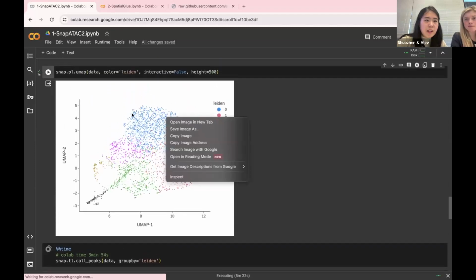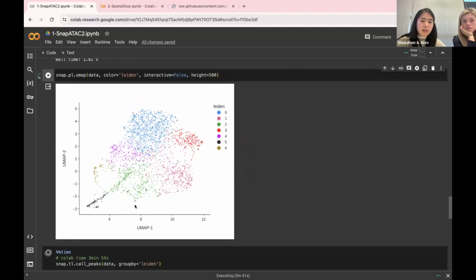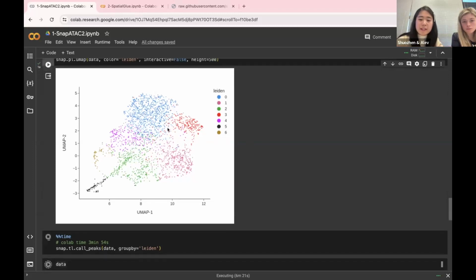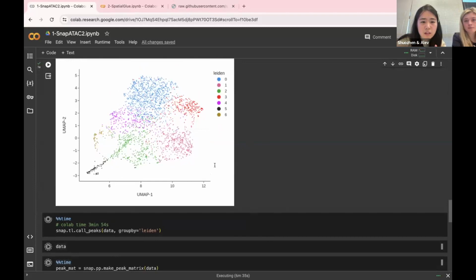If we go back to see the clusters here, while doing the ATAC data analysis, we always have the clusters first before we call the peaks. This is not like single cell RNA-seq, where we identify our clusters with the differentially expressed genes, right? Here, the original data from the ATAC after preprocessing by Cell Ranger is a fragment matrix, and the fragment matrix already has differences. So by this original matrix, we can already have the unsupervised clustering that indicates each cluster has different fragment behavior, and based on that, we're calling the peak. So this is something different from single cell data.